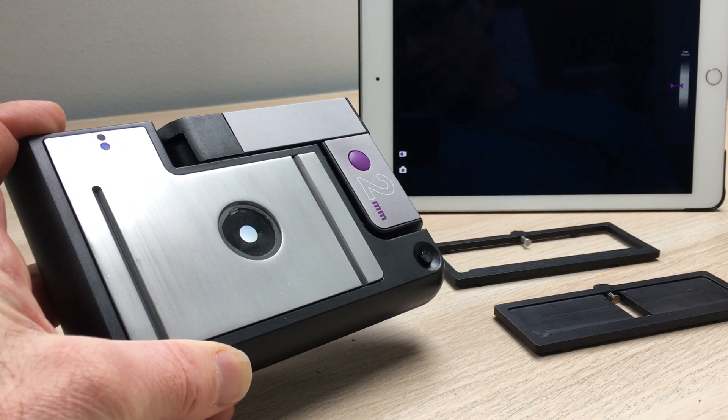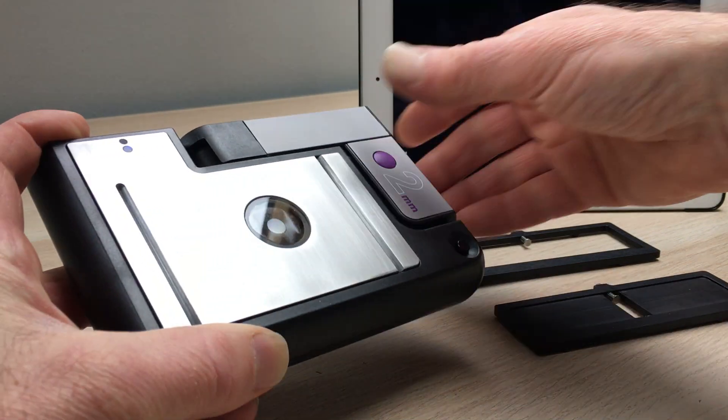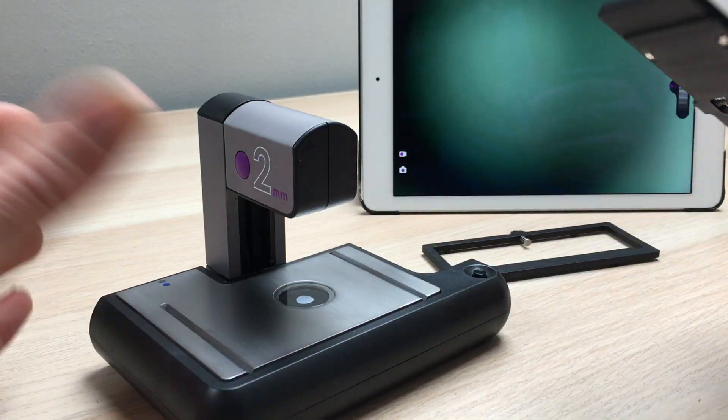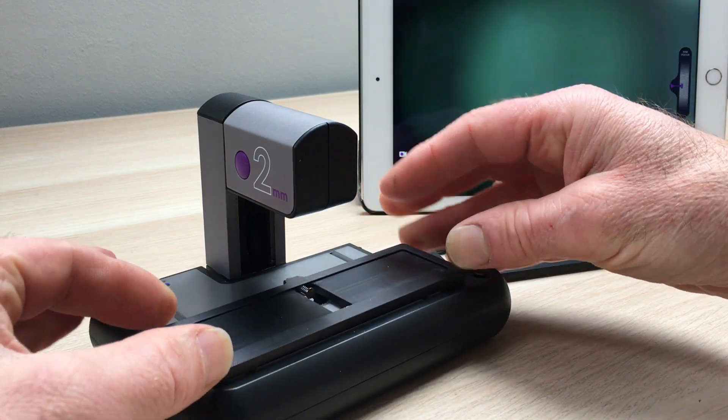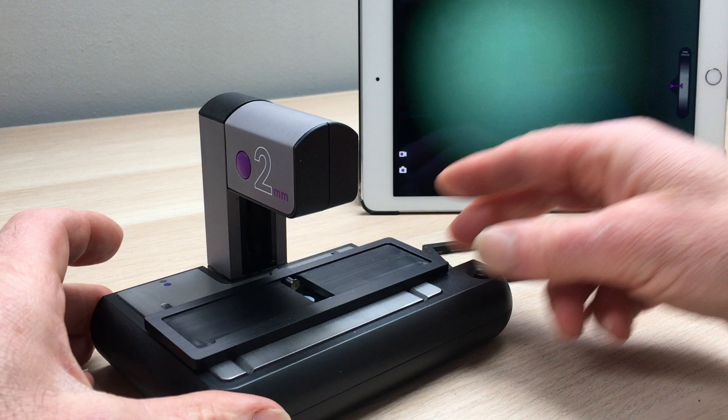Hi, this is Richard from iLite showing you our new XY version of our microscope. The microscope has a nice metal stage with grooves in it that accept carriages for either slides or counting chambers. The carriage clips in here with magnets.